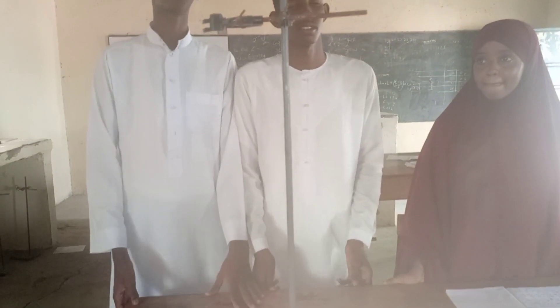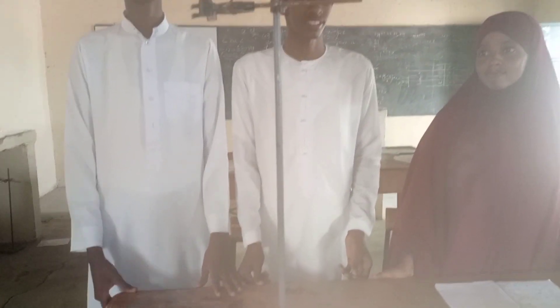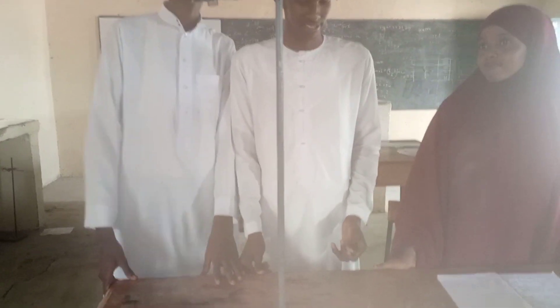Here we have a conical flask, and this is a pipette — as you can see, the pipette measures 25 ml. Here we have a burette which usually measures 50 ml, running from 0 to 50 ml, and here we have a complete stand which will be used to hold the burette.